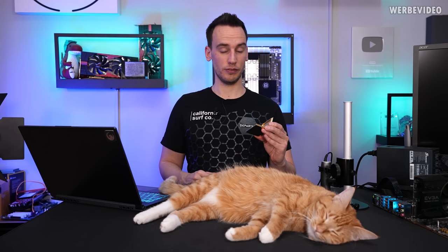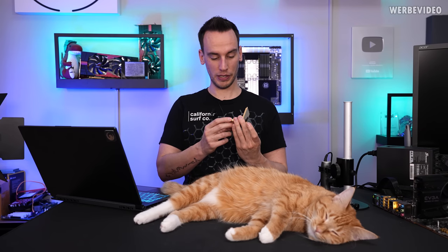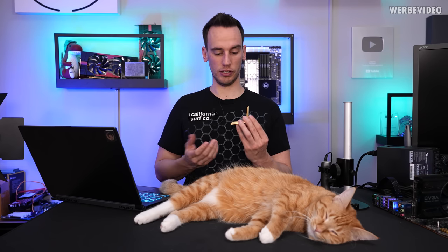Then David got in contact with us. David is a former blue badge Intel engineer, which means that he worked at Intel and they gifted him an Intel 4004 anniversary clock celebration piece. It feels very massive and it's a clock that has an Intel 4004 die sitting on top, which is awesome because this means the die was never packaged. This also makes it a lot easier since we don't have to use any kind of acid or damage the surface.